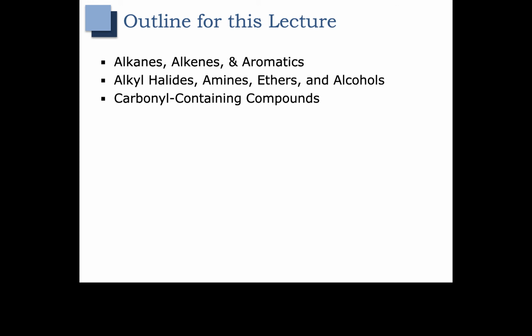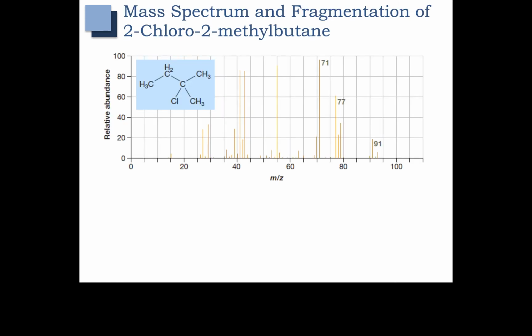In this lecture, we're going to talk about fragmentation pathways in mass spectrometry of alkyl halides, amines, ethers, and alcohols. First, let's look at alkyl halides. We have an alkyl chloride here, 2-chloro-2-methylbutane, and first we can see a couple of interesting things.